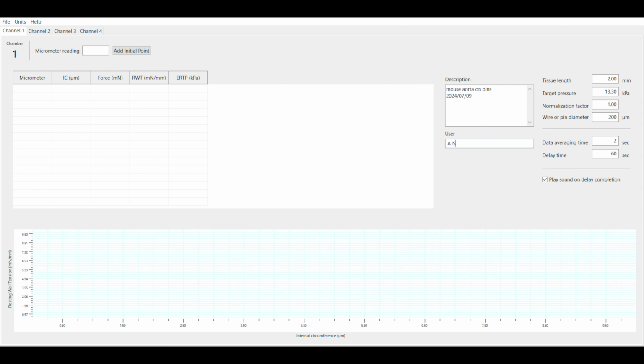This video will show how to use the MyoNORM software to normalize your vessels for each experiment. Before starting normalization, you will need to set the parameters for each tissue you will be normalizing. These can be different between each channel.